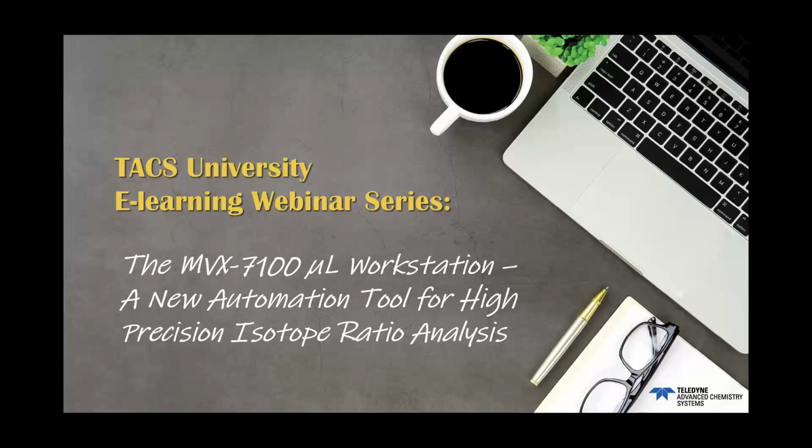I am responsible for the ASX7000 series automation, and one of the systems that's part of that group of automation is the MVX7100 microliter workstation, which I'll be discussing today. I'll be discussing that with respect to isotope ratio analysis and how we would use this system for high precision work. So I will make a start.